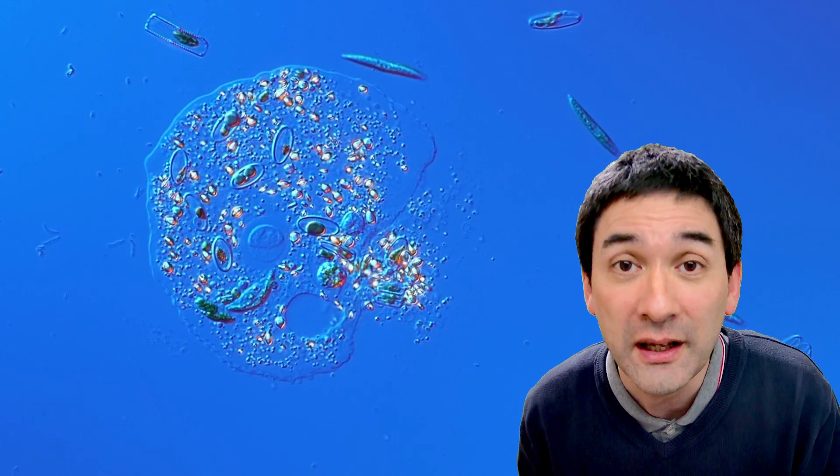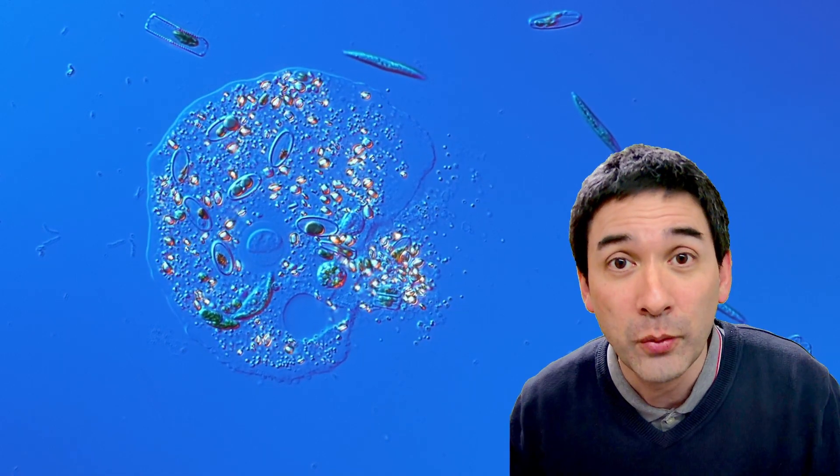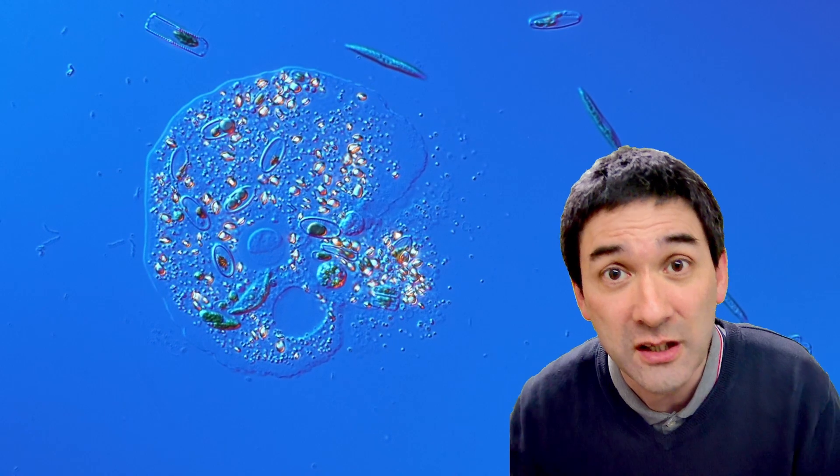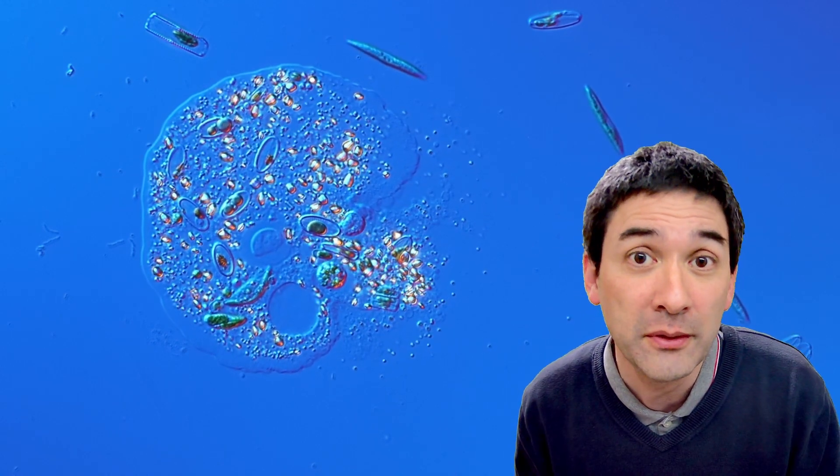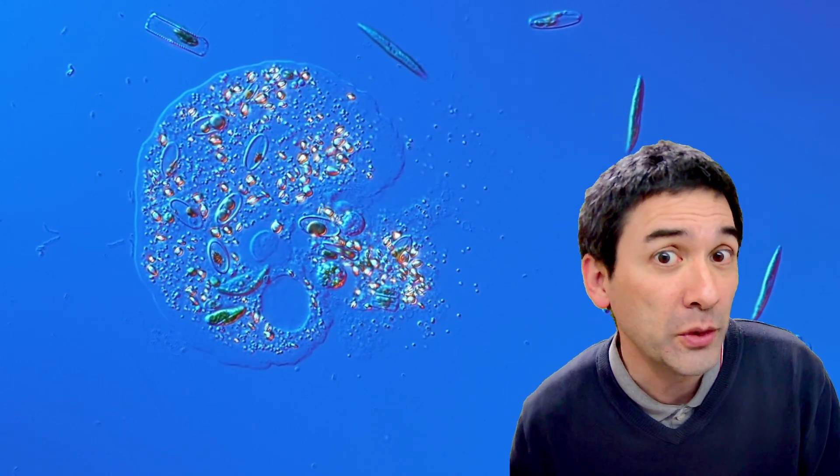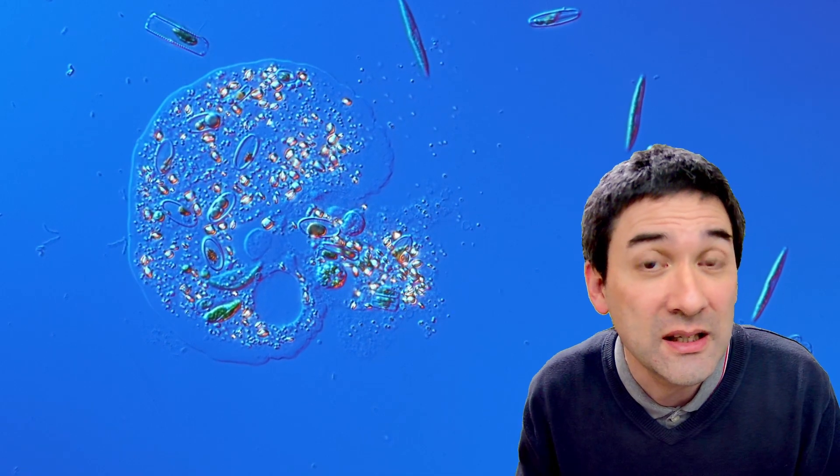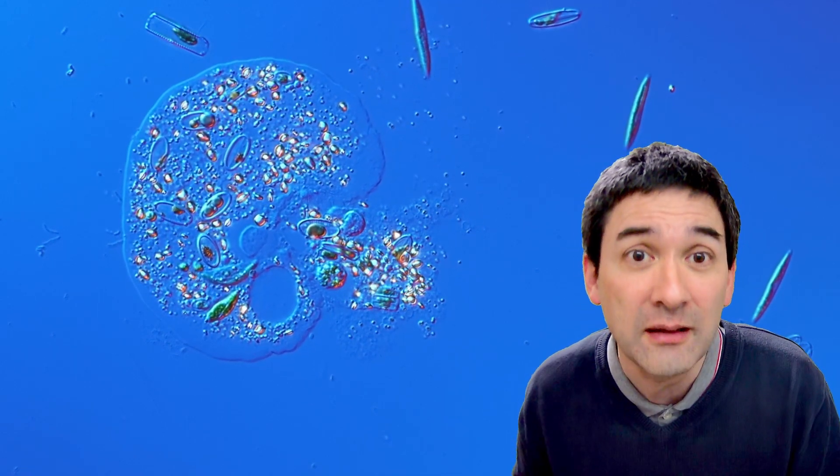Yeah here we go again. This is now the amoeba which is so squashed flat that essentially they already started to become round. Not in time-lapse anymore, but what you can see here is that essentially the cell's contents are now released out into the medium.